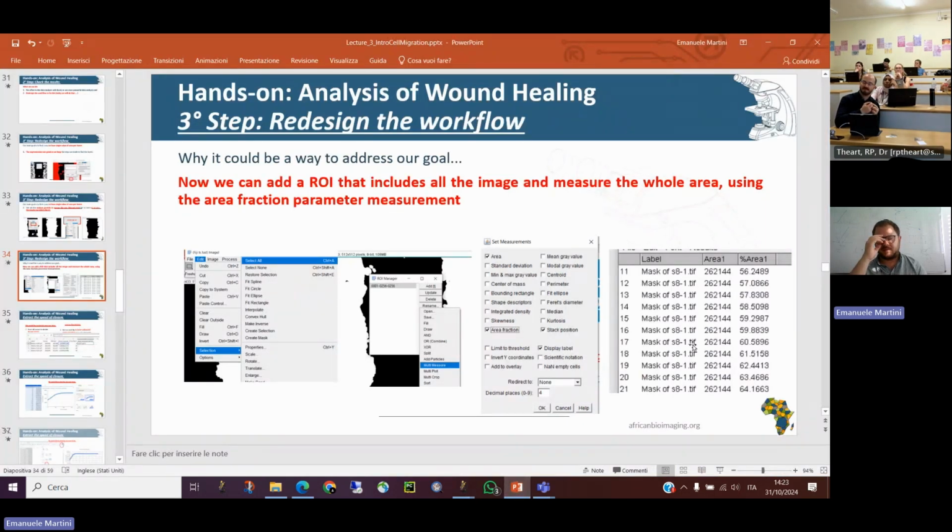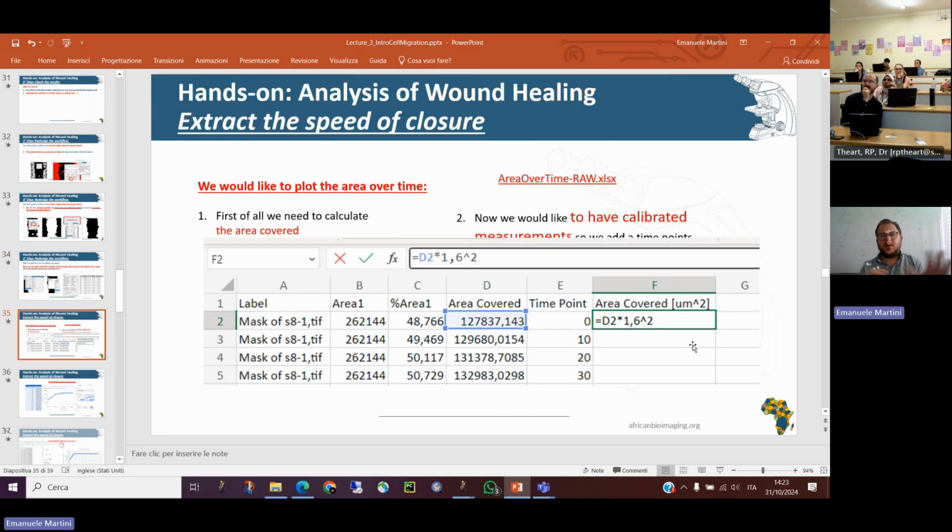You will have an Excel file in the folder I put yesterday. And now we can perform the so-called data analysis. We will try to do it all together. It usually takes 20, 25 minutes. If it's becoming too late, I will push it faster, okay?